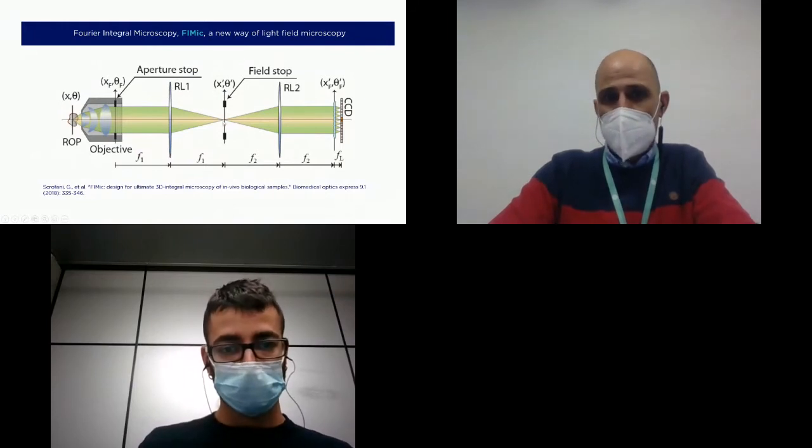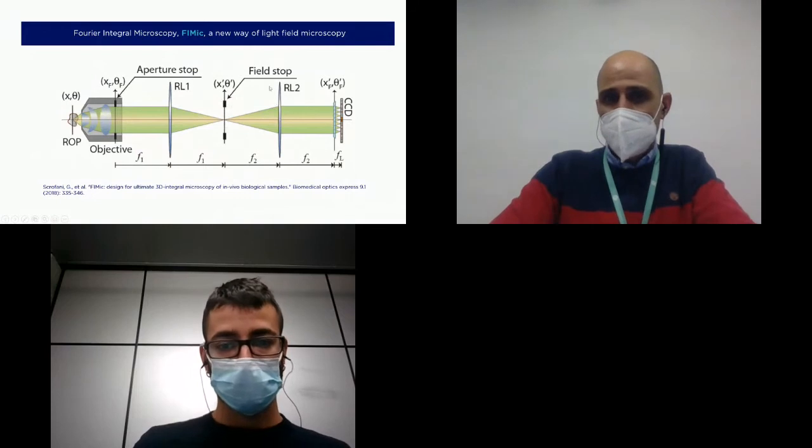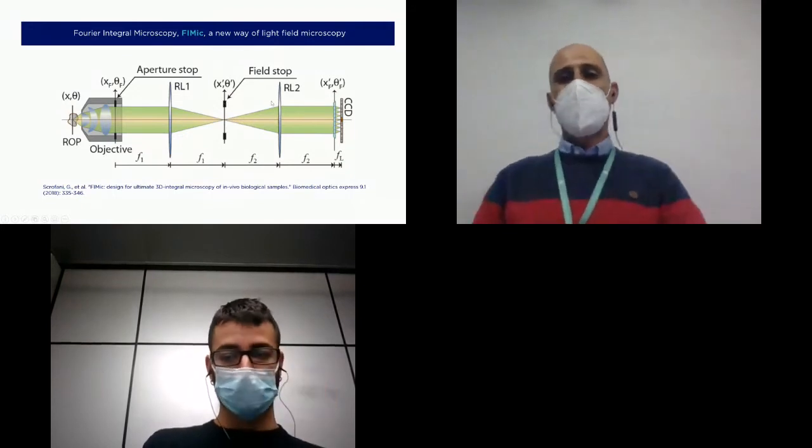This system forms an image here, and then with an additional lens, the images are projected parallel towards the microlens array.